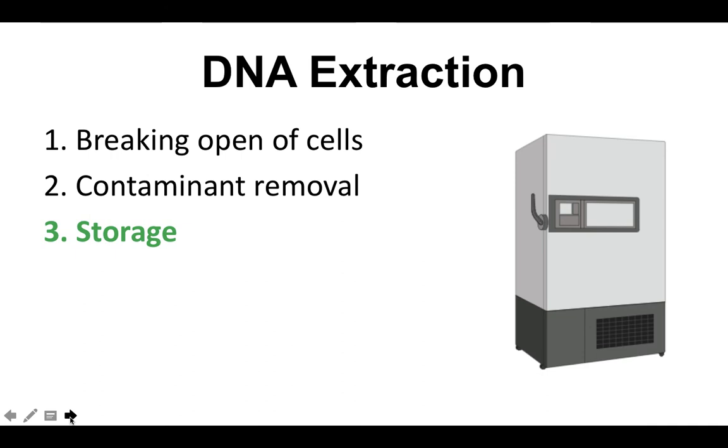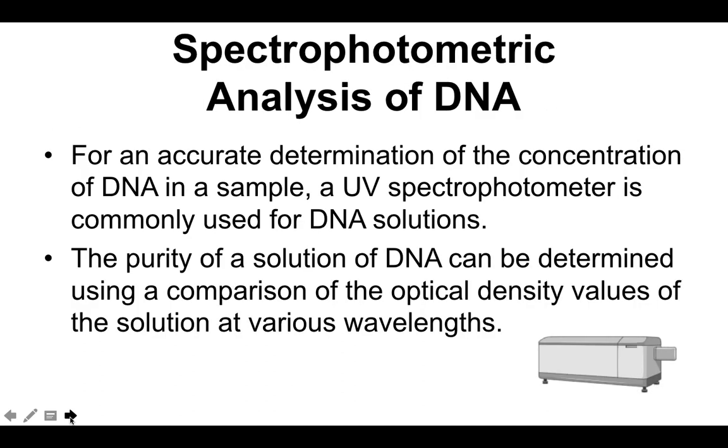It's already okay. Now, after extraction, analysis of quantity and quality of DNA must be carried out. For our laboratory activity, we will carry out spectrophotometric analysis of DNA.